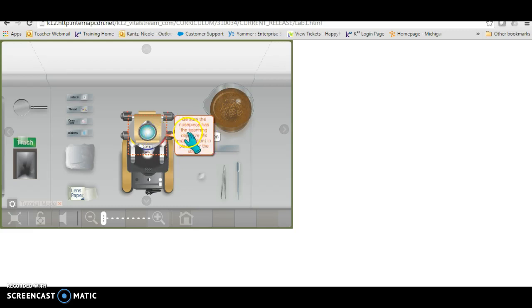Make sure the nose piece is at the 4 times magnification. So I'm going to switch that over to the 4-times magnification. And then we're kind of starting here with steps. Let me find it. We're starting in part 1 right now. So we cleansed the lens, we turned on the microscope, we adjusted the diaphragm and ocular to be correct, and turned the nose piece, and now we are on step 6 of part A.